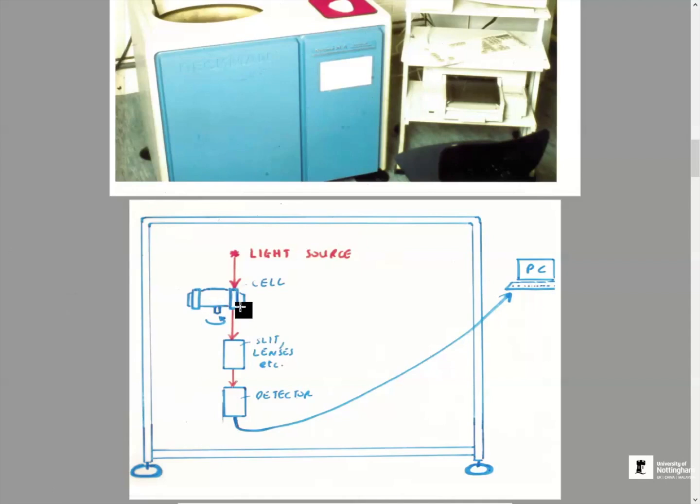If it's a protein, we would use what wavelength? 280 nanometers, yeah. Or we could use a different type of optics, not absorption optics. We could use something called refractive index optics. Remember that? If we're looking at a polysaccharide solution. So you've got that choice of optics, UV absorption optics or refractive index optics.